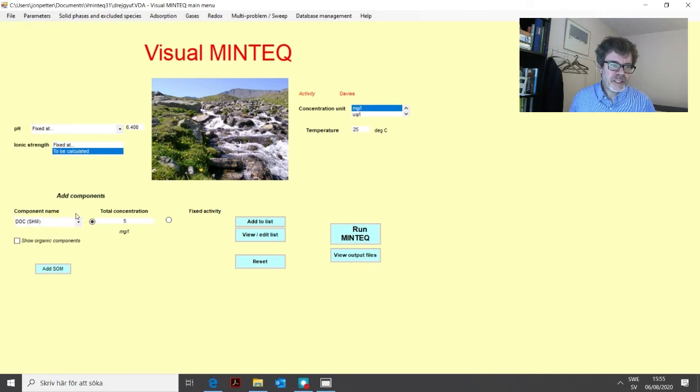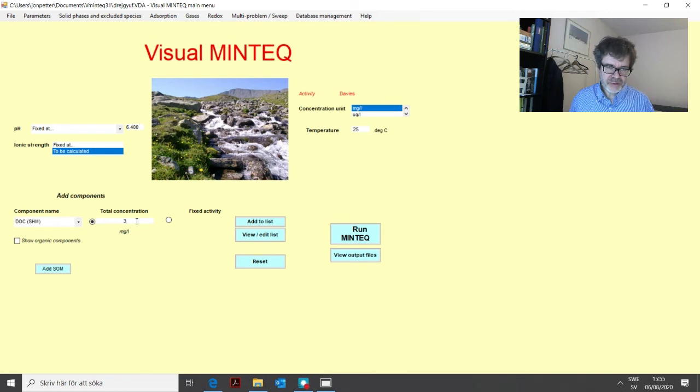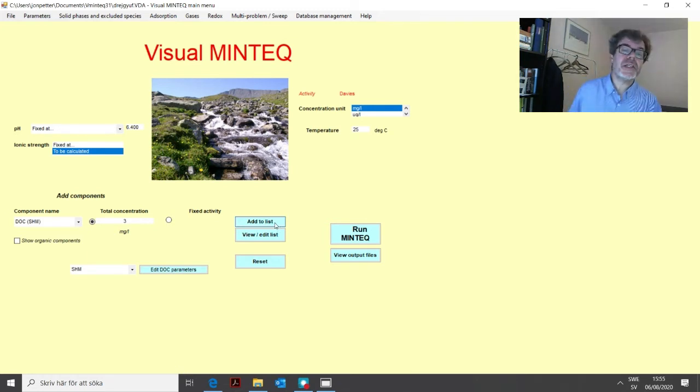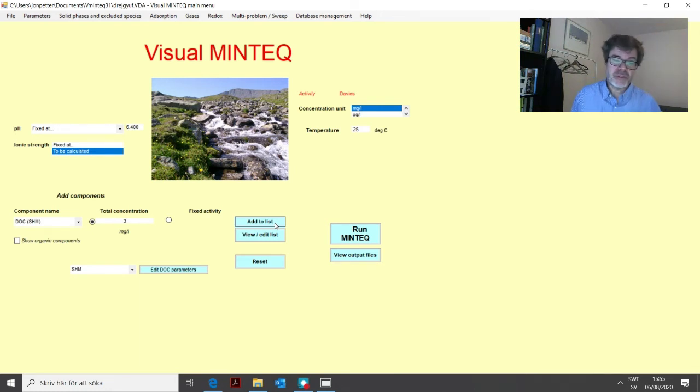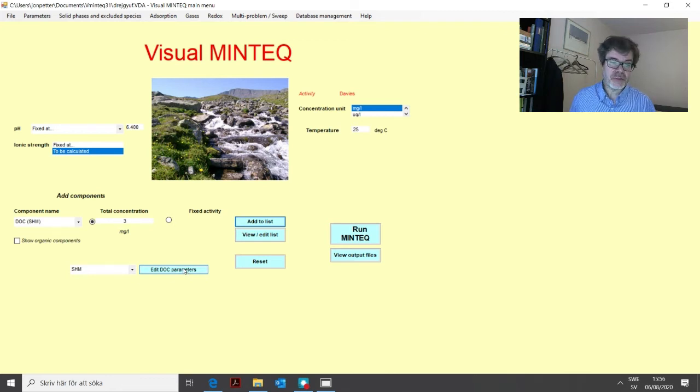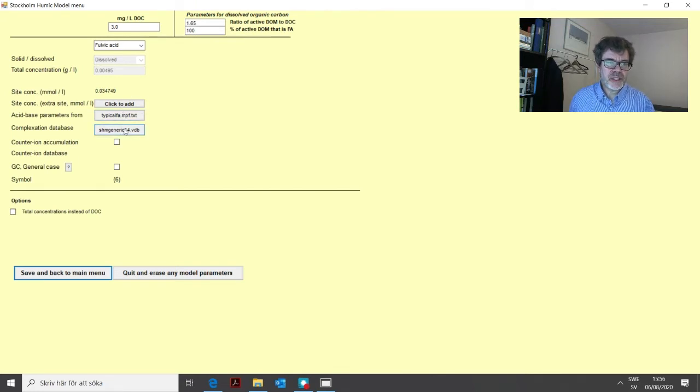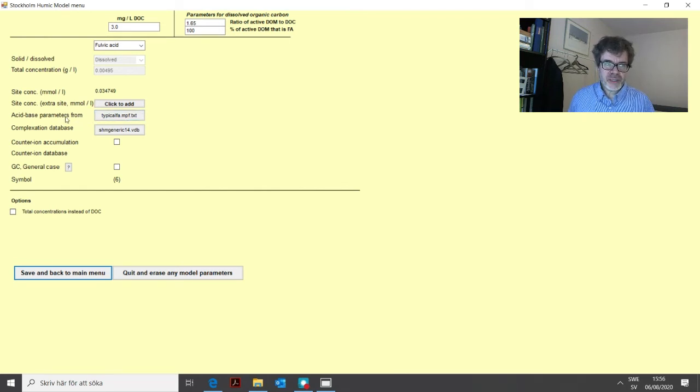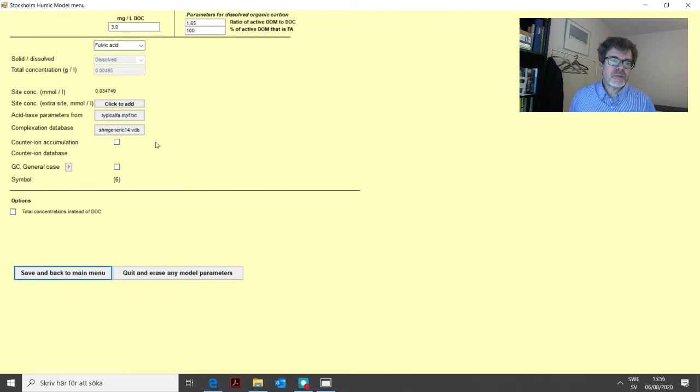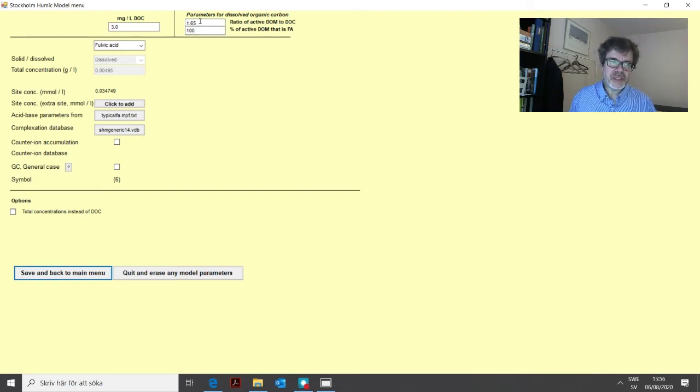If we have, let's say that we have three milligrams per liter of DOC that we have measured. So then we simply enter three milligrams per liter and then add it to the list. And that's actually all we need to do if we are happy with the different default assumptions and default parameter values that we have assumed for this particular model. Now, if we want to change something or review these different values, we click Edit DOC parameters. And that will take us to a menu which in turn contains links to other more detailed parameters for acid-base parameters and log Ks for different complexes it might be formed.